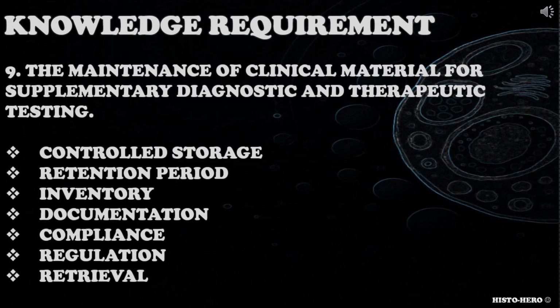The ninth knowledge requirement is the maintenance of clinical material for supplementary diagnostic and therapeutic testing. Candidate needs to have the knowledge and understanding about the maintenance of clinical material. You could ask the candidate to explain, why is the proper storage of wax blocks and slides important, to name optimal storage conditions, how they would store and document storage of clinical material in your lab, what the retention period for clinical material is, why is proper storage of clinical material important when it comes to supplementary diagnosis or therapeutic testing, and how to find out where the clinical material is stored.